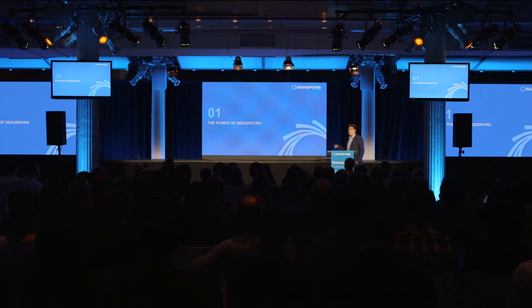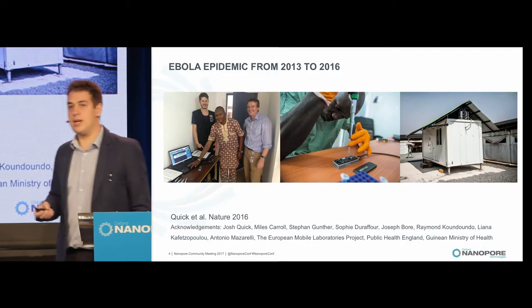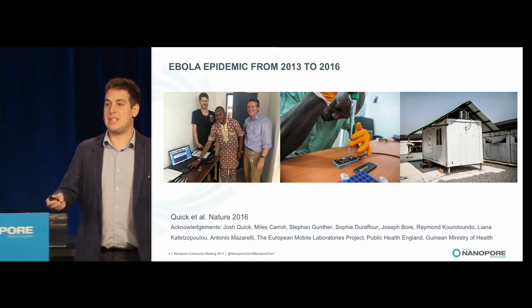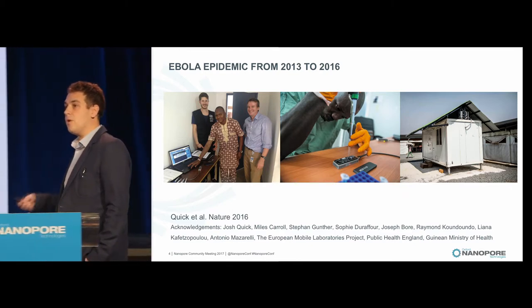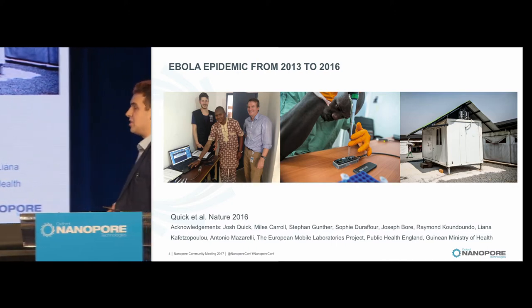So I'm going to remind the audience of the power of doing sequencing for outbreaks and epidemics, and I'm going to return to a subject that you may have seen me talk about already, but I do think this is a critically important piece of work, which was how we managed to investigate chains of transmission during the Ebola epidemic from 2013 to 2016. You may recall that we were able to establish a remote sequencing lab in Guinea, packed up in what we call a lab in a suitcase.